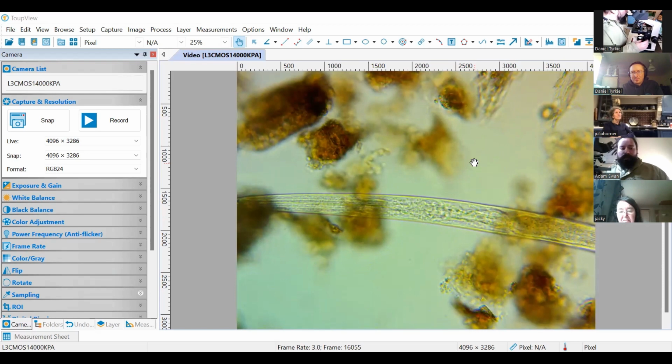Cool, so we would manually go through the sample and count these guys. In this sample, I've seen about 3. I haven't done it systematically because we want to move on to talk about the next parts of the sample.